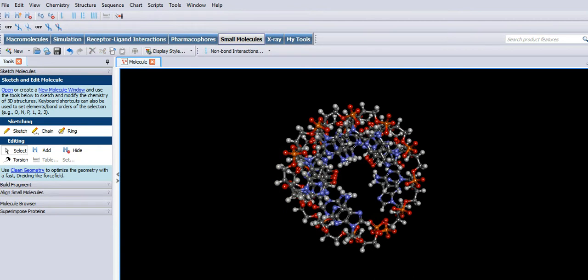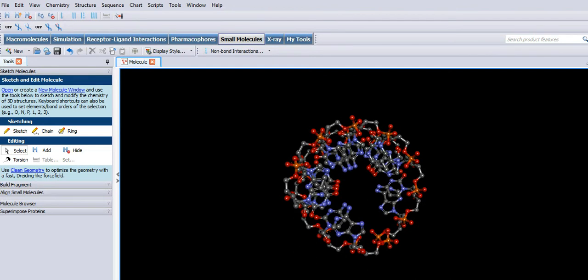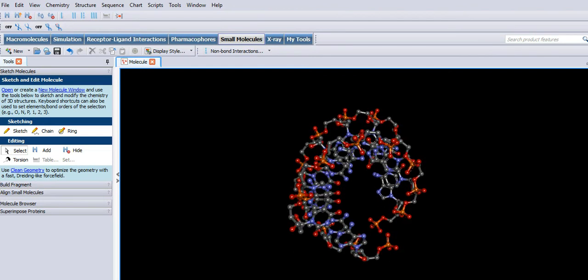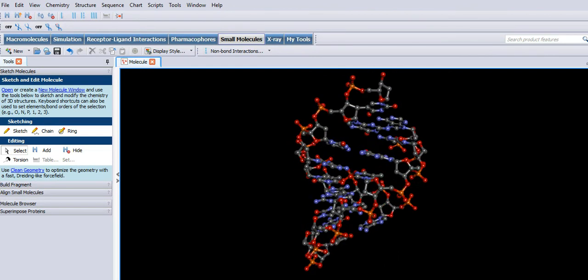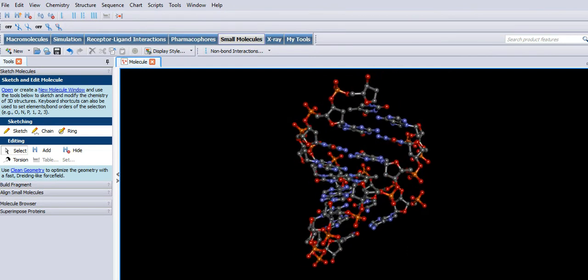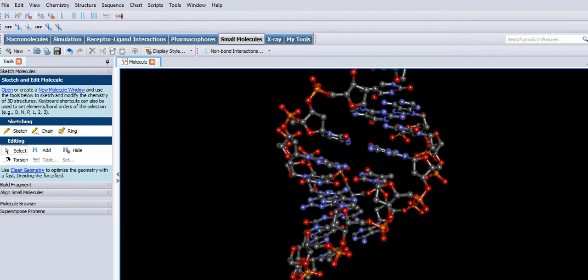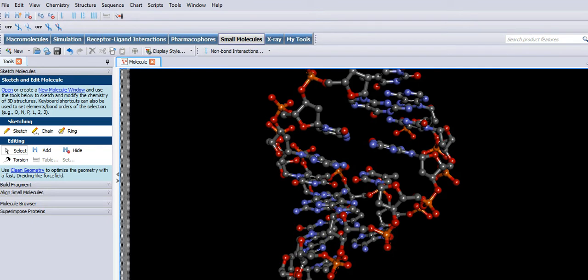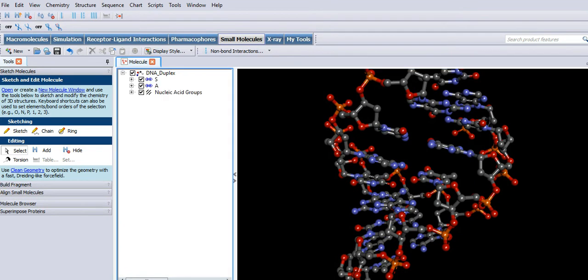Let's hide all the hydrogens. It automatically selects the companion, the corresponding base, so adenine will link up, it'll add a thymine, etc. That's spectacular, isn't it? You have the hierarchy window again to the left, very useful.